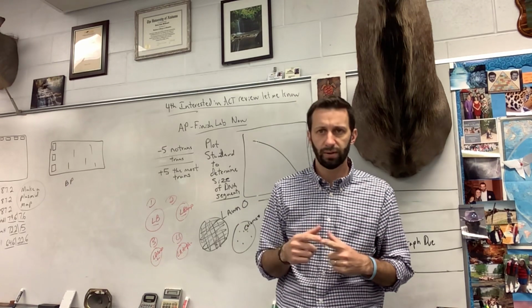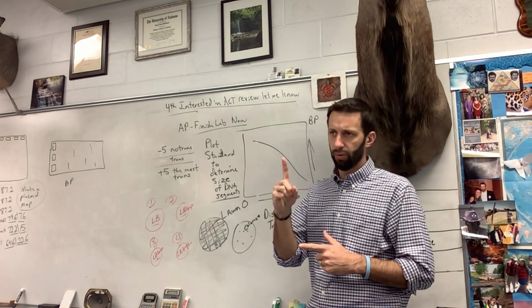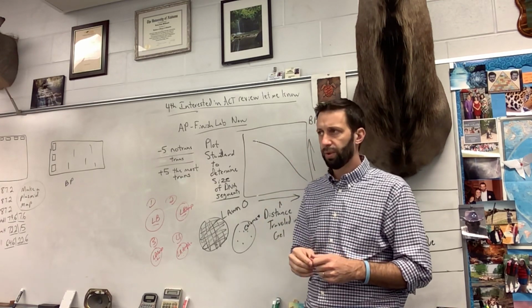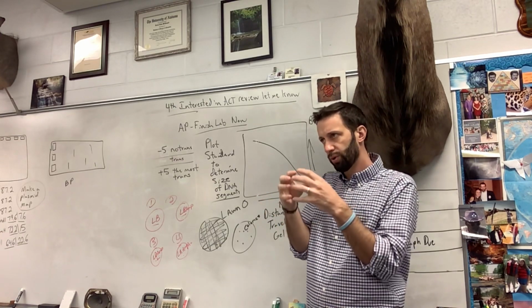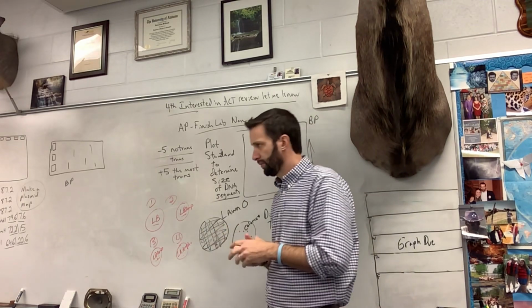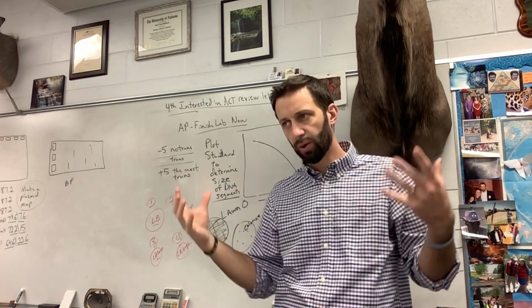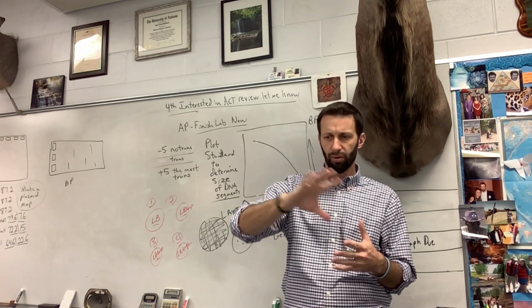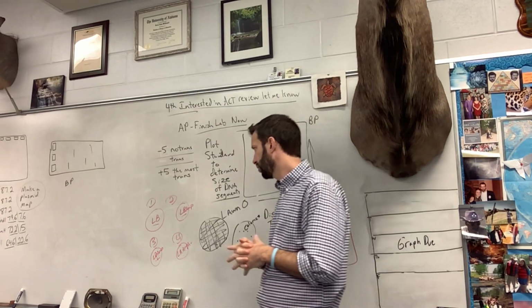And when you're looking at bacteria, saying are there bacteria present or not, there are 3 different things you could put. 1, no. 2, colonies. Colonies are little dots of bacteria, because that means you have one bacteria that started to grow into a colony. So if you see a colony, that's one original bacteria that grew into that colony. There's probably millions there now. And then the other option is lawn. Lawn means you smeared your bacteria all over the plate and they're all growing, so you basically got the whole thing covered like a lawn. You should be able to tell, because it'll have a smeared appearance where you did that. So yes, that's what you should expect for number 1.